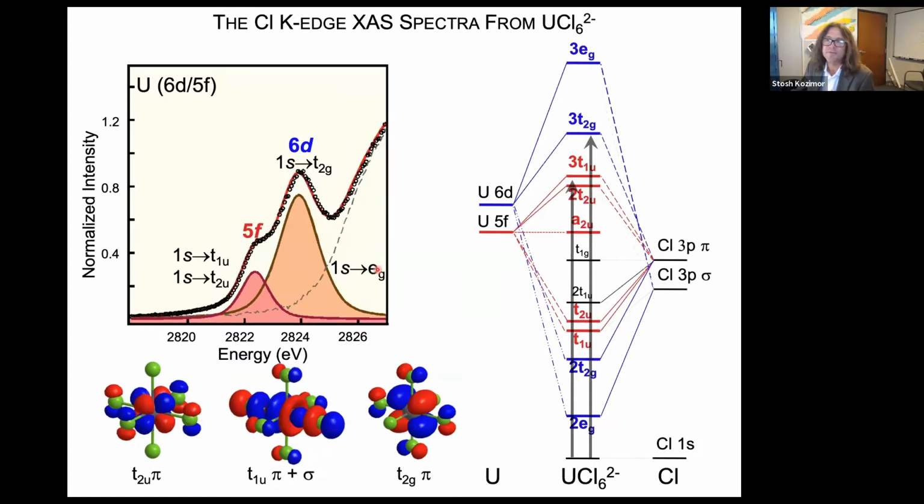So the way that we solved this is we arm wrestled to see who would be right. No, we did a whole series of experiments to try and understand if that was correct or not. And I haven't told you exactly how it worked. We really made the titanium, zirconium, and hafnium measurements afterwards to try and help us understand this spectrum that we first obtained. And their interpretation, spoiler alert, is correct. I'll show you some experimental validation for that interpretation.